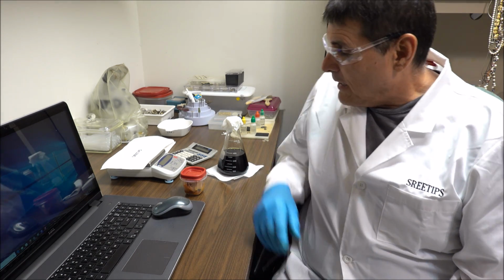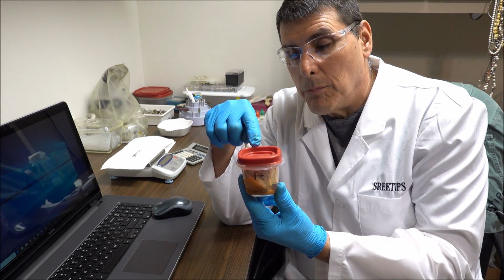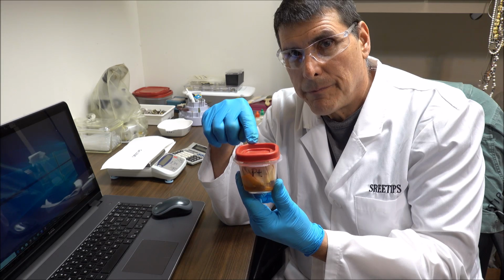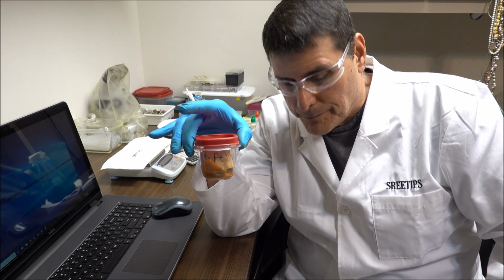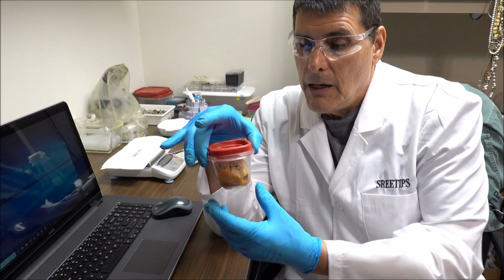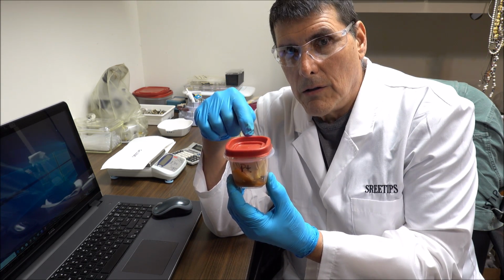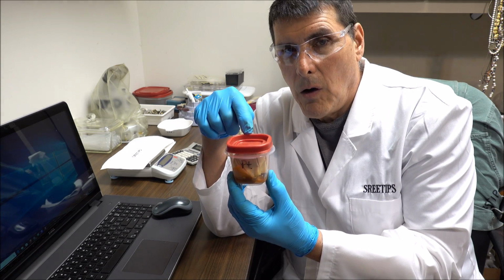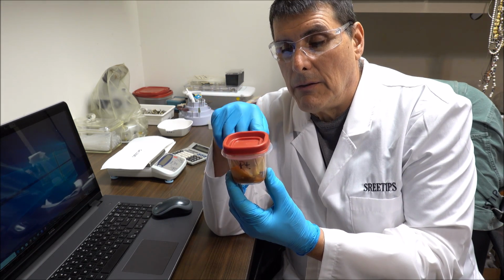This will conclude part 15 of the Stockpot Refining series. I was able to get some platinum salt and I combined it with my other platinum salts that I've been saving. I have yet to get 1 milligram of platinum metal from all these experiments that I've done. And what I intend to do is redissolve this salt and process this all by itself and try to get some pure platinum.